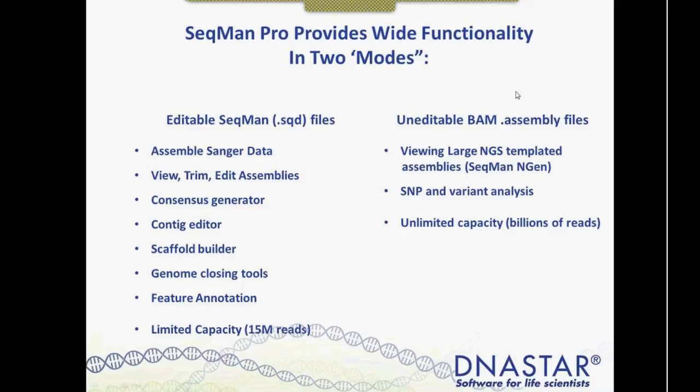Now, the other mode is the BAM mode, and we've got lots of webinars recorded on our website that focus on this new BAM file. And the idea with BAM files is that SeqMan becomes really more of a viewer, a way to look at assembled data rather than an editor.